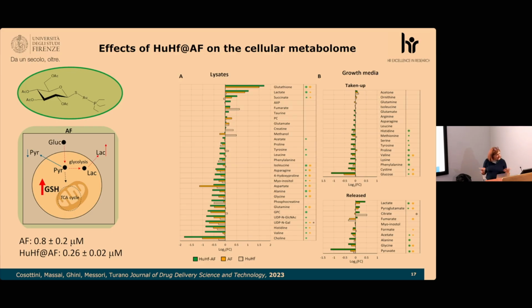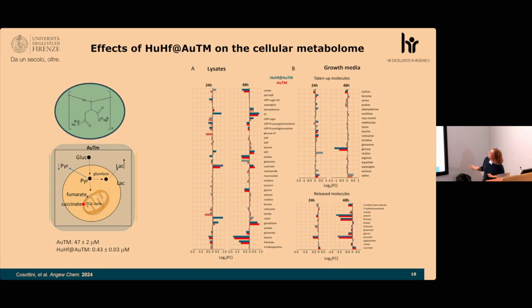The meaningful changes are those highlighted here, and they are the same at the level of the lysates and the growth media. So with auranofin, it works. So this could be a good carrier. What happens if I try with aurothiomalate?